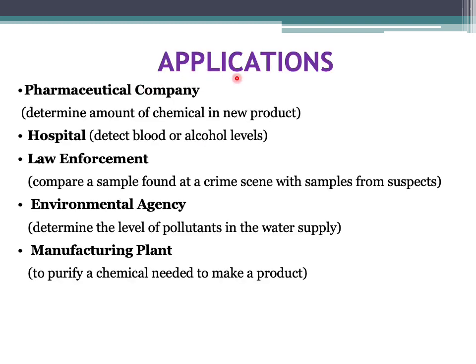So this is the applications for chromatography. First, for the pharmaceutical company, for example, to determine the amount of chemical in new product. Or in hospital, we use to detect blood or alcohol level. So we use chromatography. Or law enforcement, if we want to compare a sample found at a crime scene with sample from suspect.